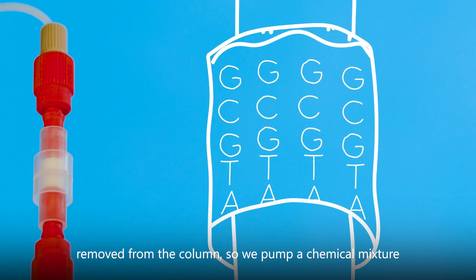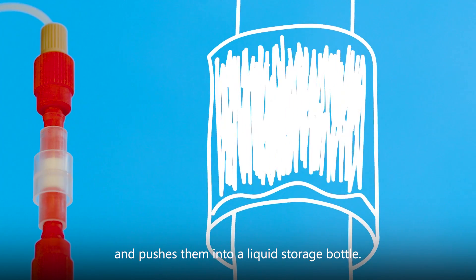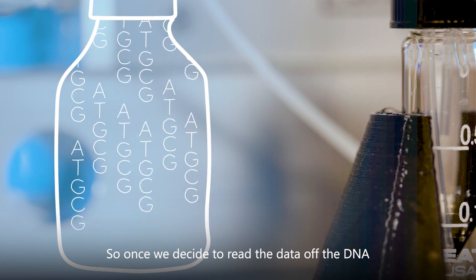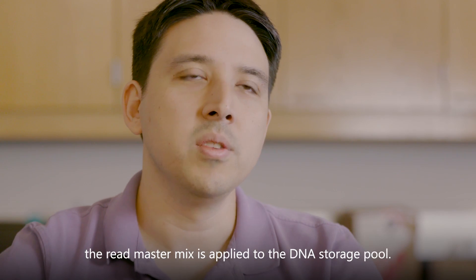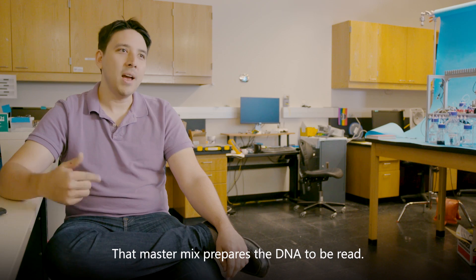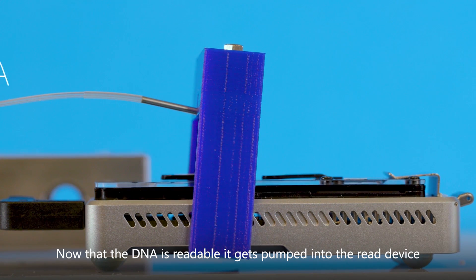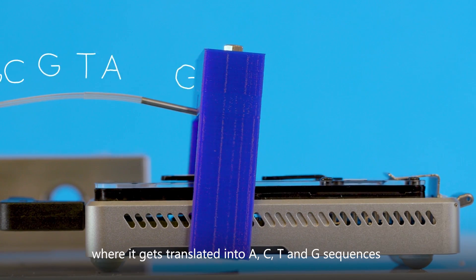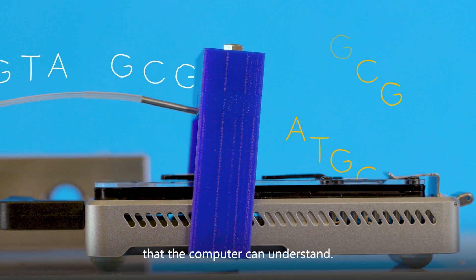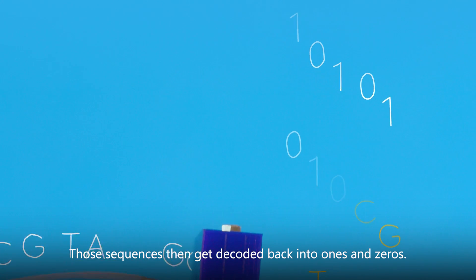We pump a chemical mixture into the column, which frees them from their solid support and pushes them into a liquid storage bottle. Once we decide to read the data off the DNA, the read master mix is applied to the DNA storage pool. That master mix prepares the DNA to be read. Now that the DNA is readable, it gets pumped into the read device where it gets translated into A, C, T, and G sequences the computer can understand. Those sequences then get decoded back into ones and zeros.